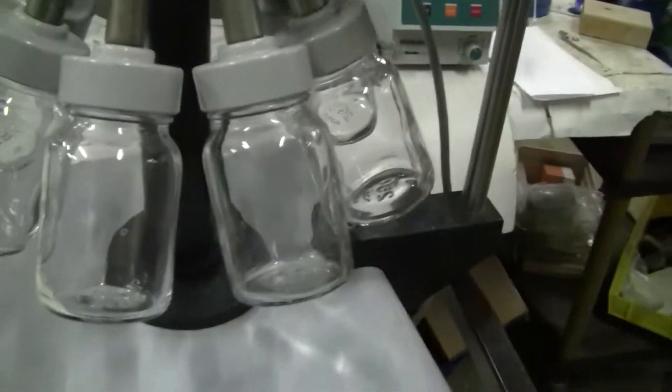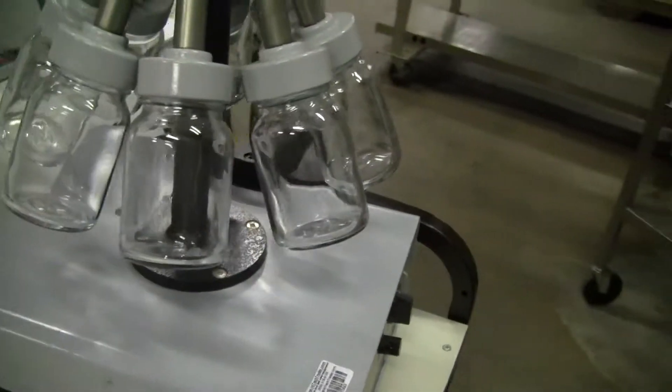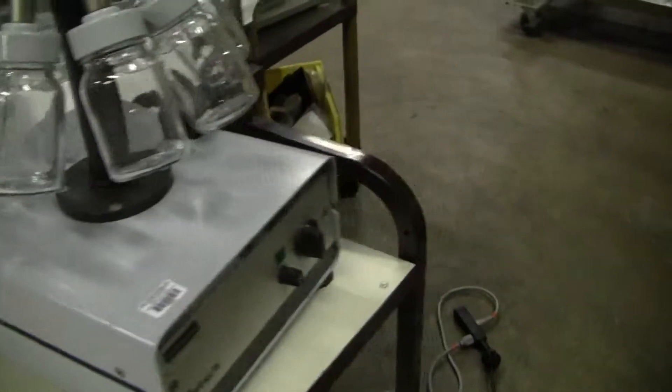You can see it has eight sample jars. They're currently 250 milliliters on there. They say you can handle 100 and 500 milliliter jars.